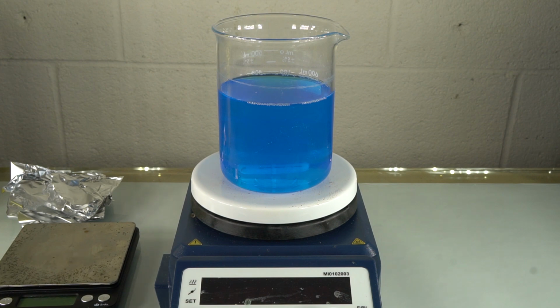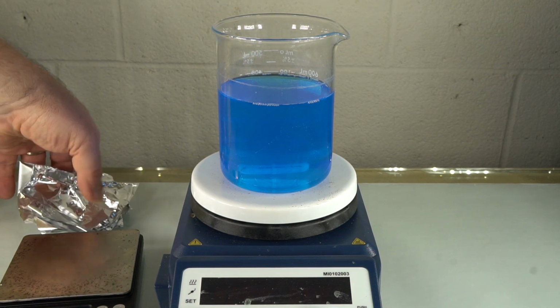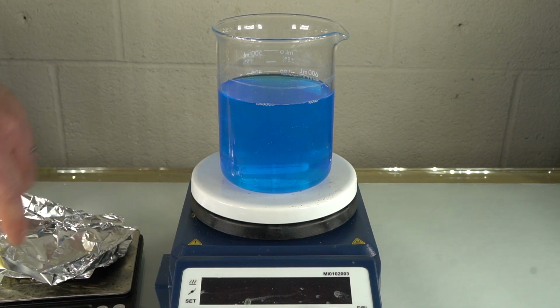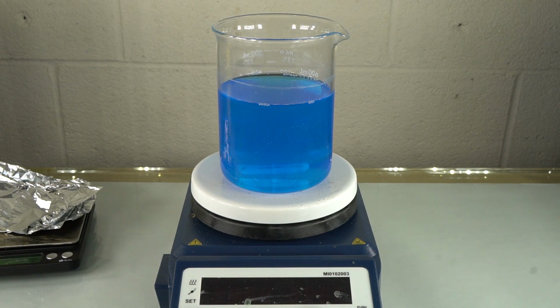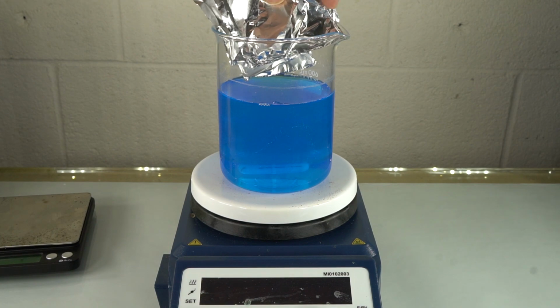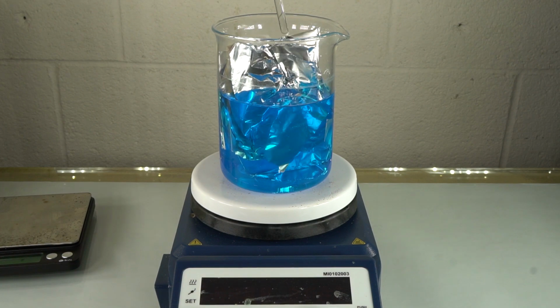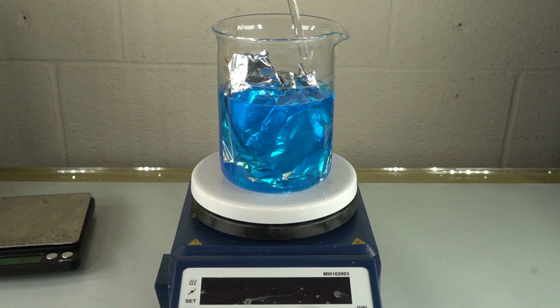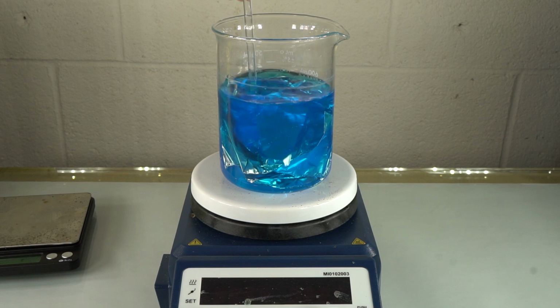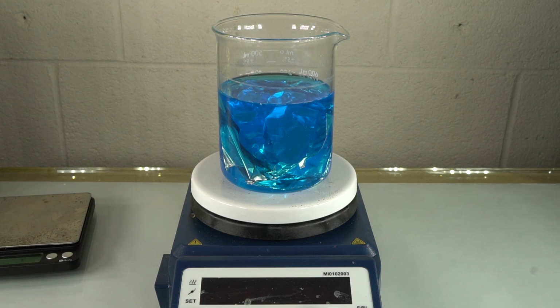So now let's add in our aluminum foil, and I should have 4 grams there. Yep, 4.00. Perfect. So I am going to carefully put this foil in. I want to make sure we get it all completely in the water, like that.